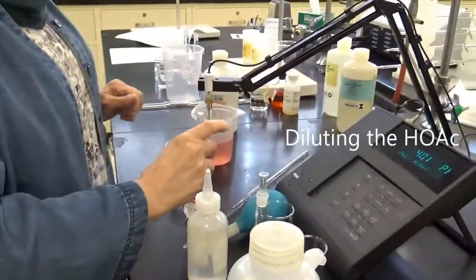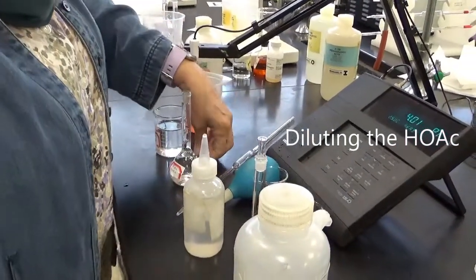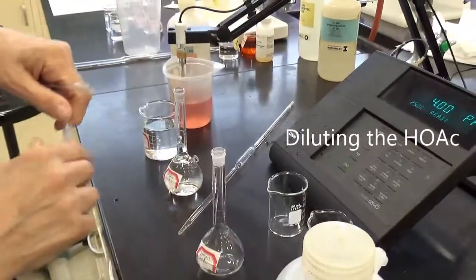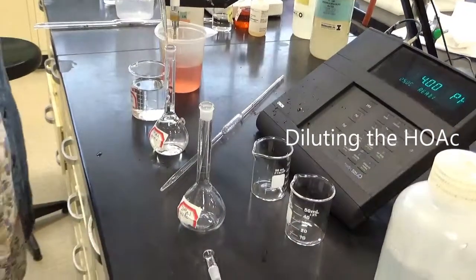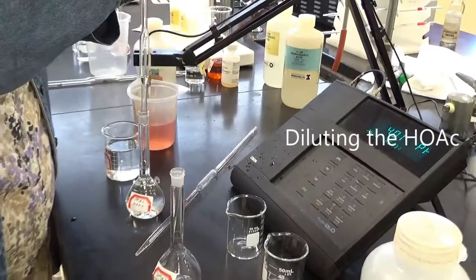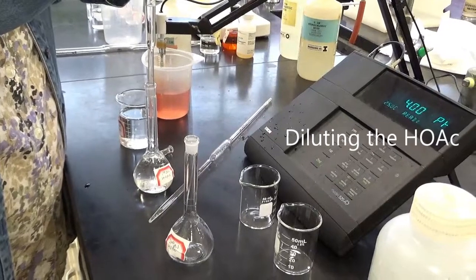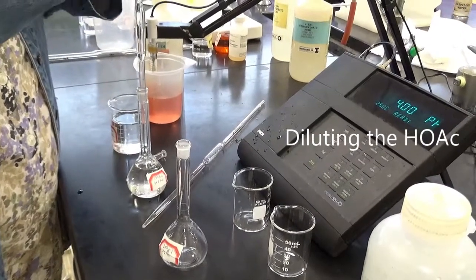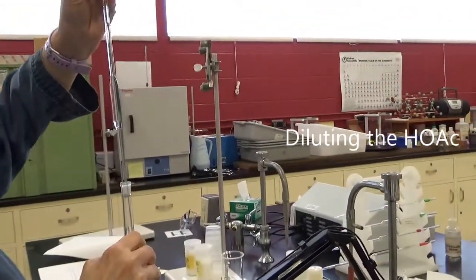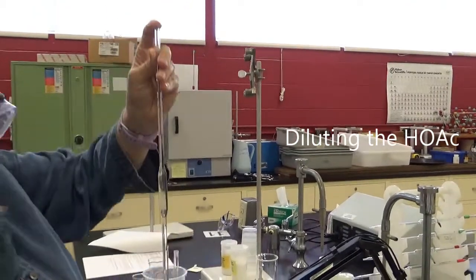Okay. And now I will take 5 milliliters of this with a clean pipette and put it in the next flask. It's labeled second dilution. Oops, not working too good. I can tell there's not a very good seal. I have to push it hard to keep the seal. Good.